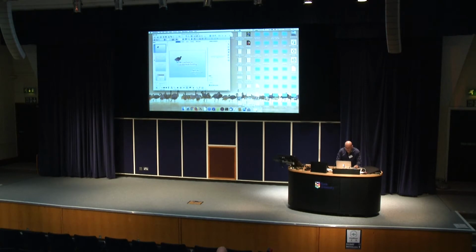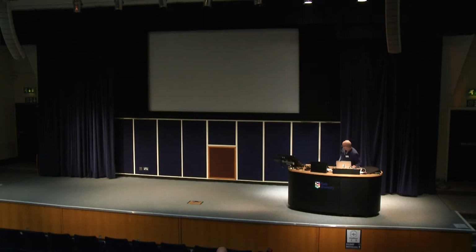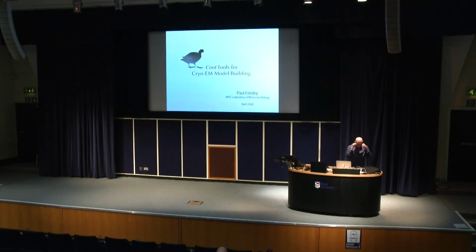That's the plan. Oh, hello. I'm going to go to displays. Is that what I want to do? Arrangement, unmirror, click, function F5. Good. Right, indeed. Thank you for the invitation. Let's see how we get on.